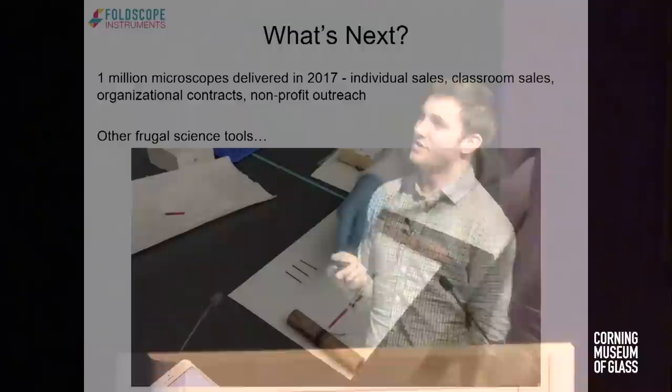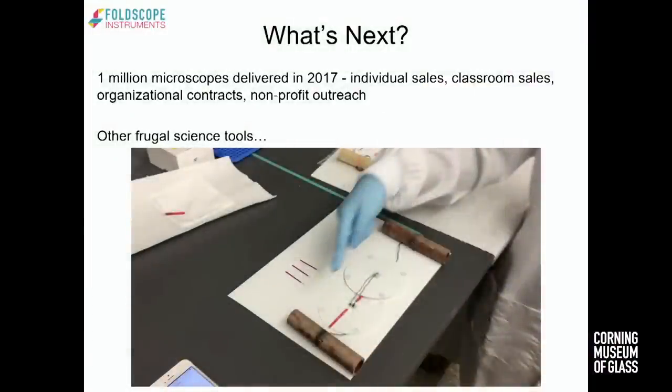And maybe the most exciting thing, which is still in the very early stages, the paper was just published by Manu's lab at Stanford, the 20-cent paper fuge. So I'll briefly show a video. This video came out, I think, just a few days ago, so this is very, very new.